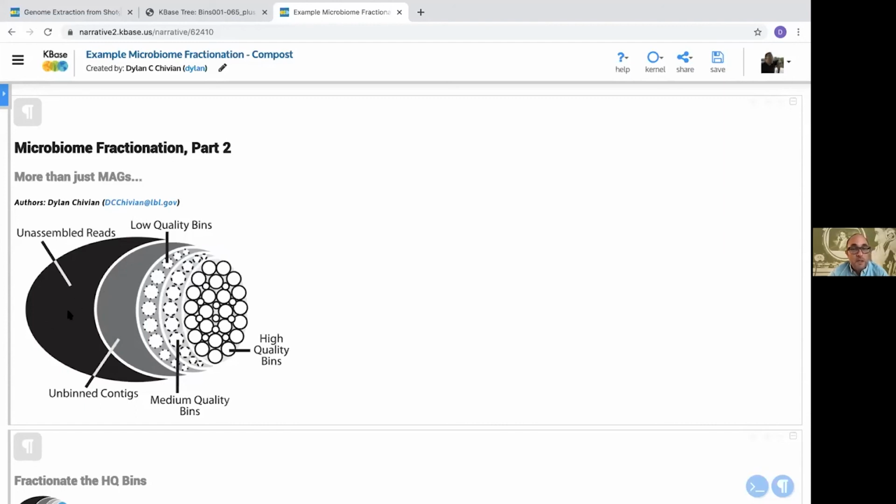Unassembled reads, there's value there. You have to be very, very, very careful. A lot of the reads represent fractions of proteins, and so the assignment of them is less trustworthy. Anyway, right now we don't offer a tremendous amount of functionality for unassembled reads other than the taxonomic placement and that sort of thing.